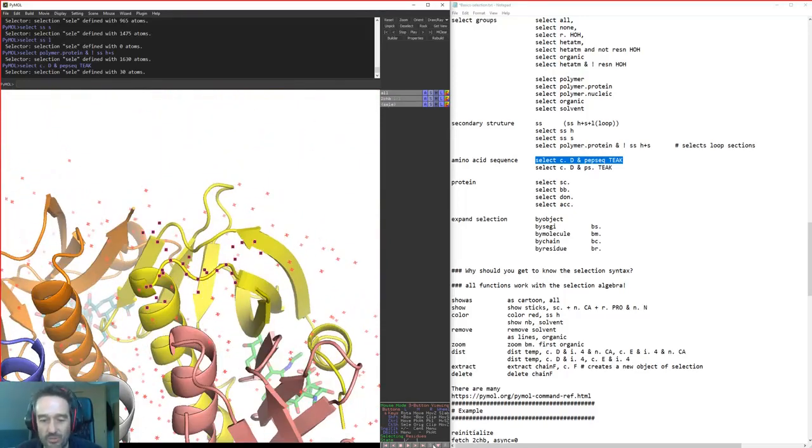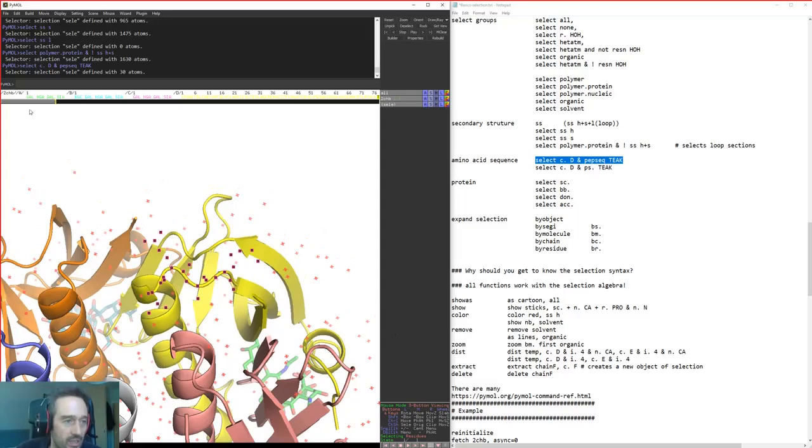And again, we could go over to our sequence view here, and whatever you've got selected always appears as a thick coloured line in the scrolling bar, so you can see that somewhere in this yellow section is that TEAK that we've asked for. You can abbreviate pepseq to ps dot.